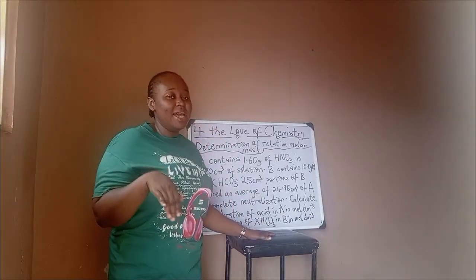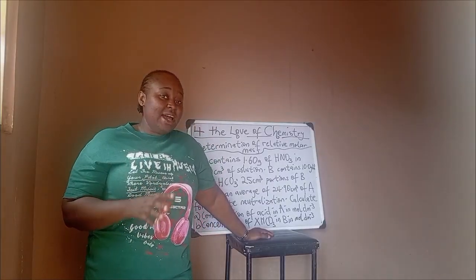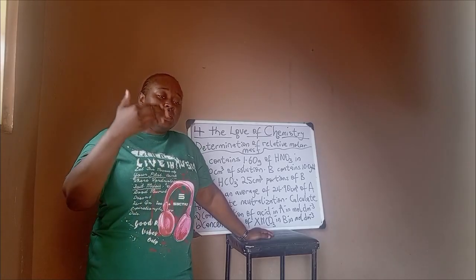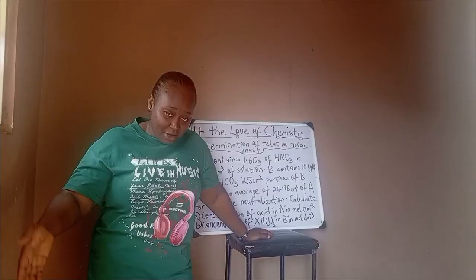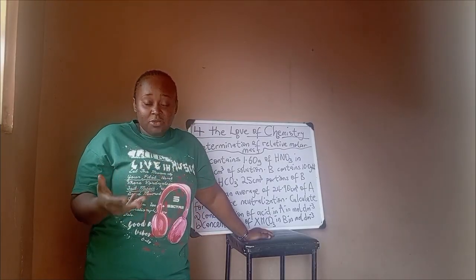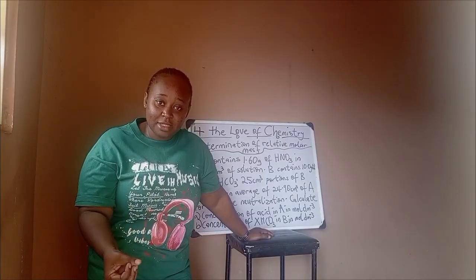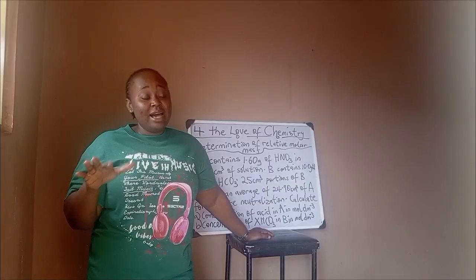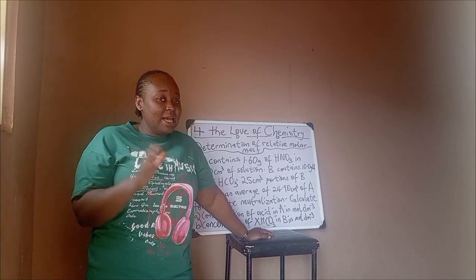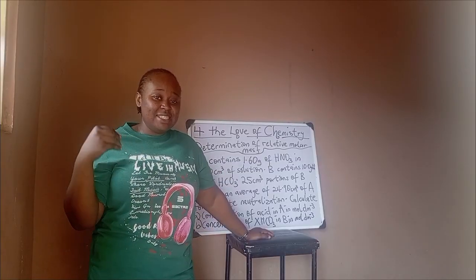Okay, so today I want to continue what I started earlier. I paused a bit so that I can tell you how to do a titration table, because since we don't have things for practical here, I'm kind of teaching you how to report your practicals. So I digressed a bit to teach you how to write your table in accordance to your teacher's endpoint.